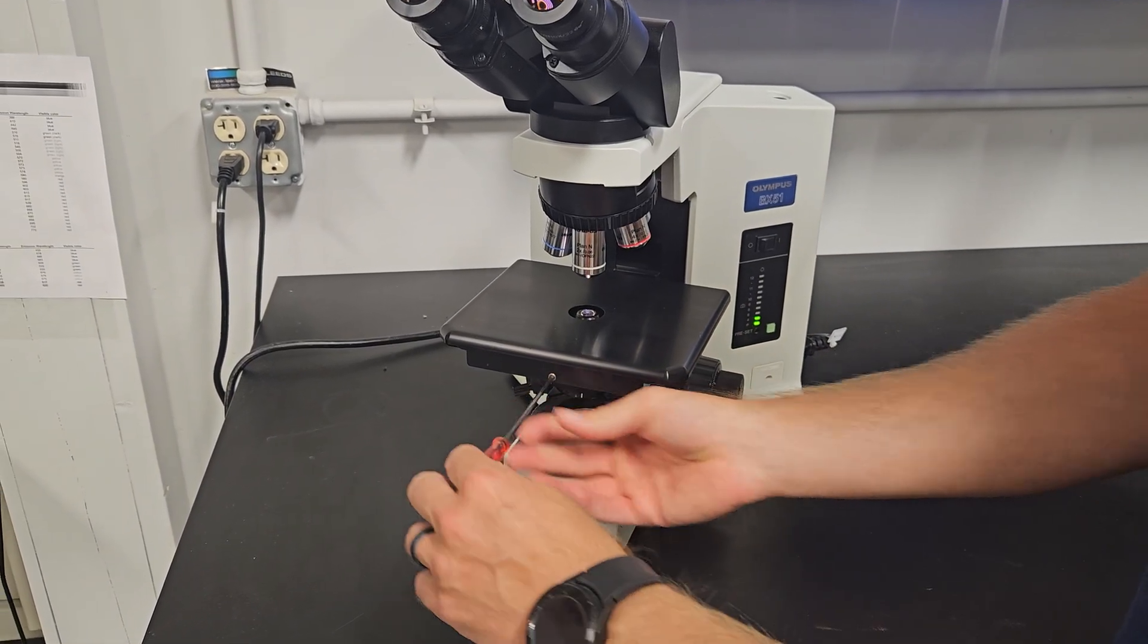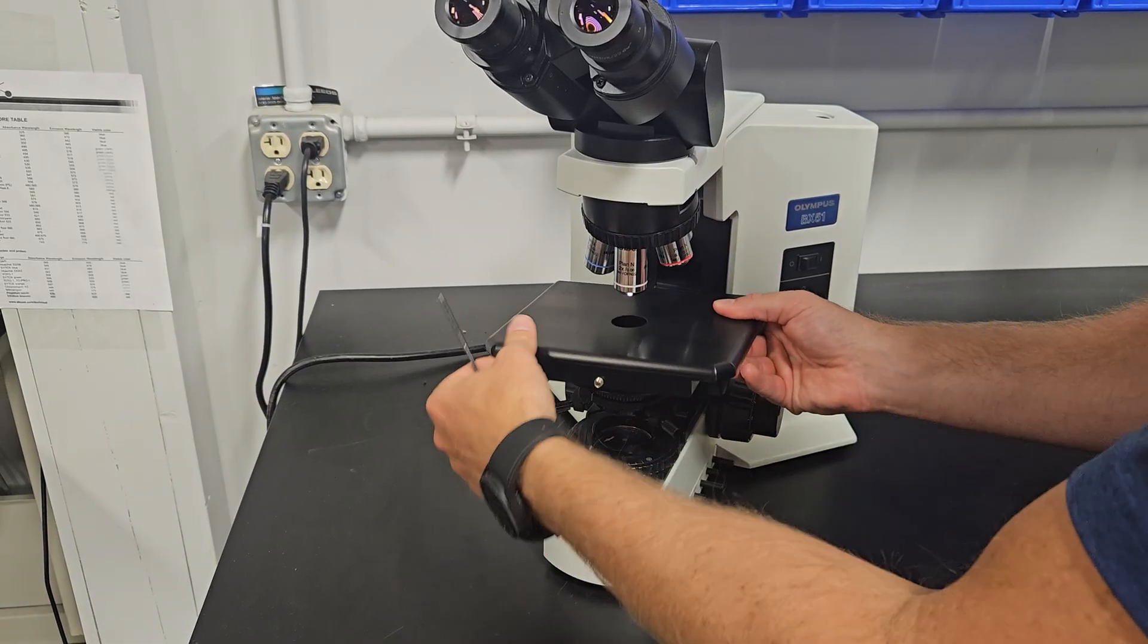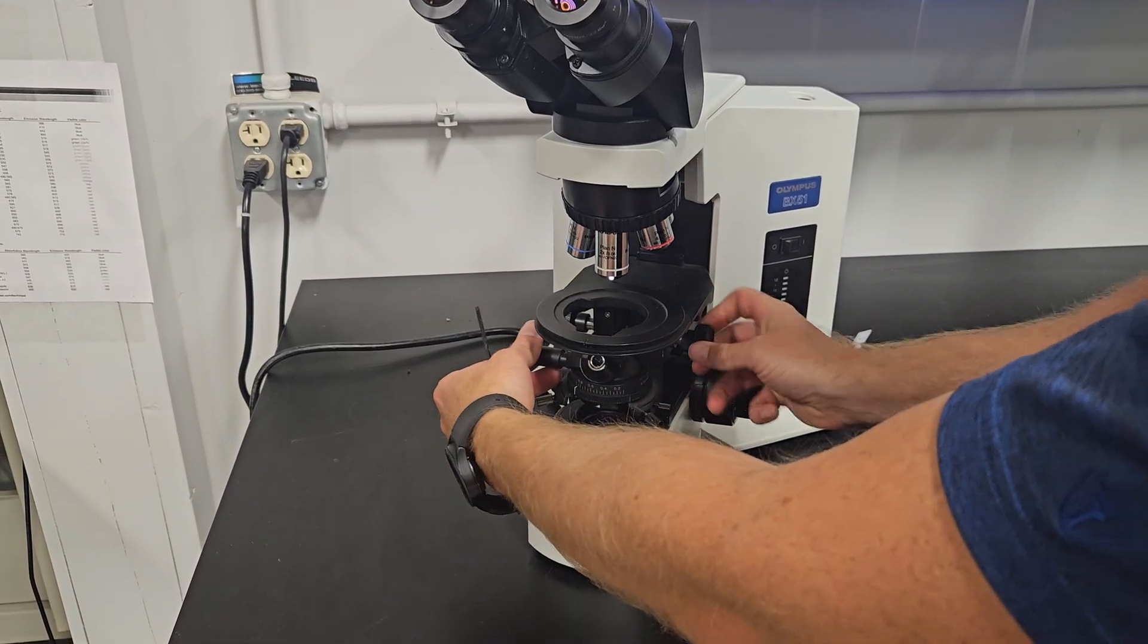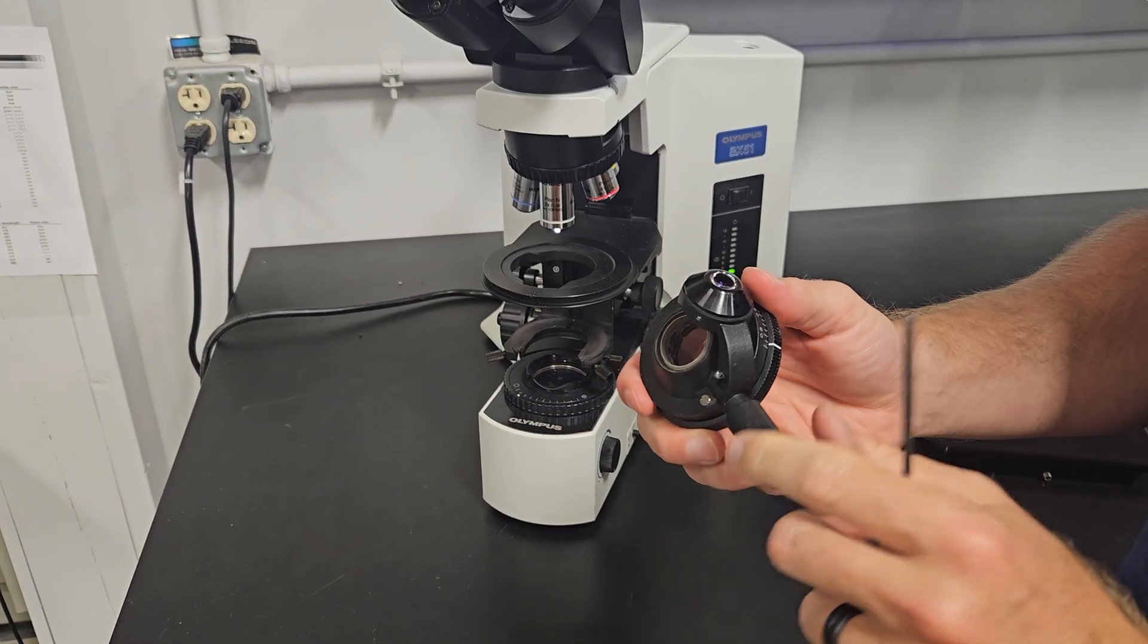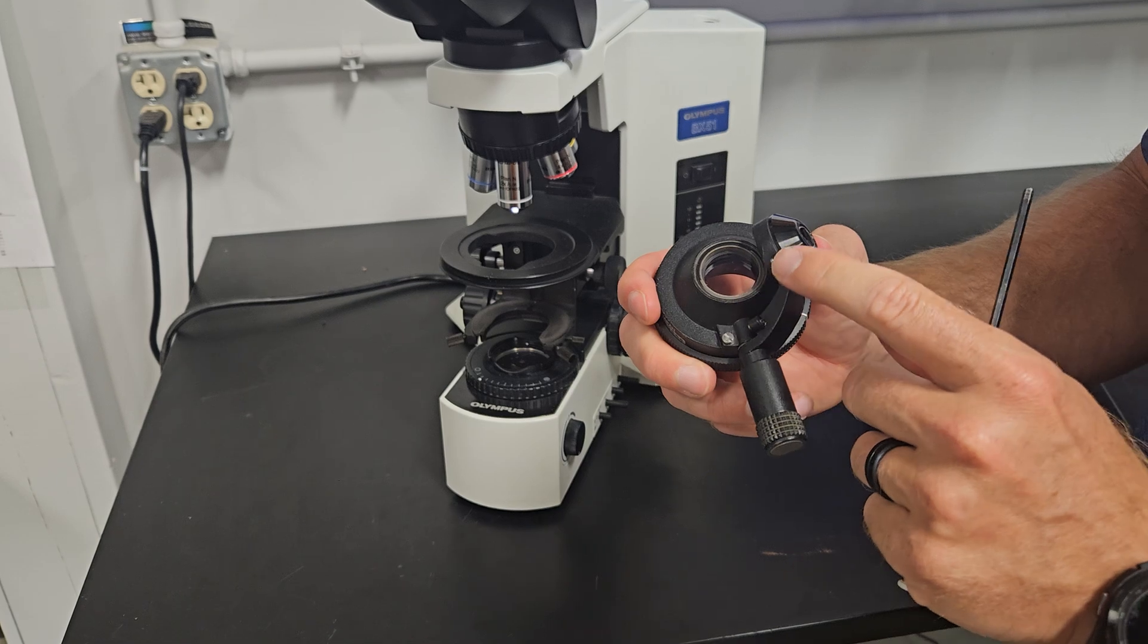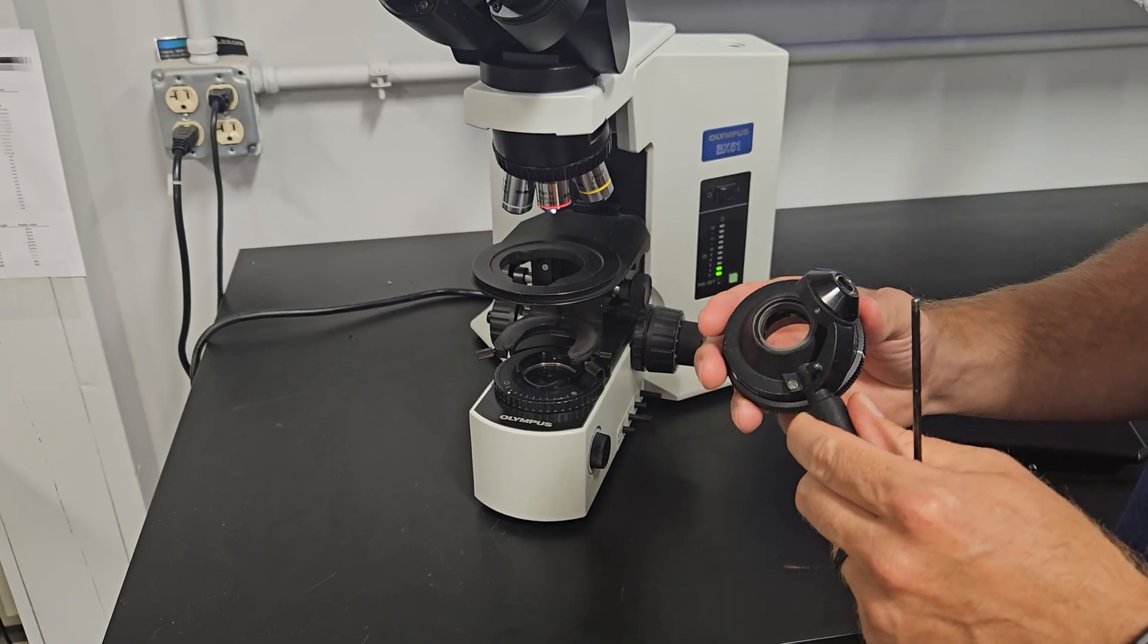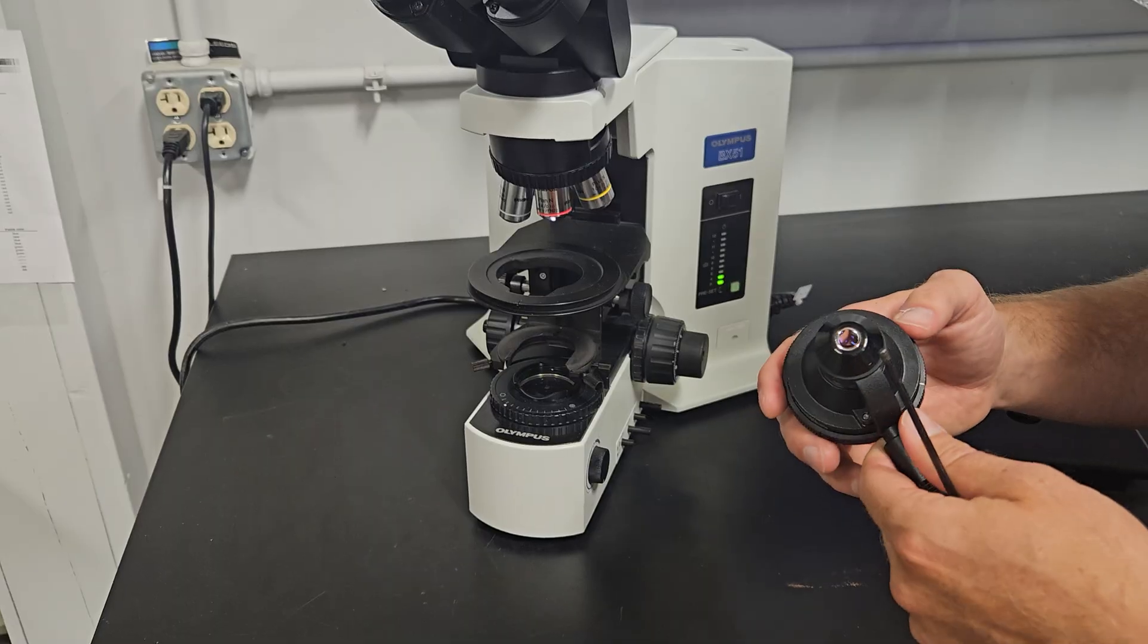We're going to take the stage off, lower it again so we don't crash it into the objectives, and we're going to flip that top lens out. Once we do that, we'll raise the stage back up, we'll lower the sub-stage condenser, and you can see that this condenser flips in and out. You're going to have the top element flipped out when you have the 2X in.